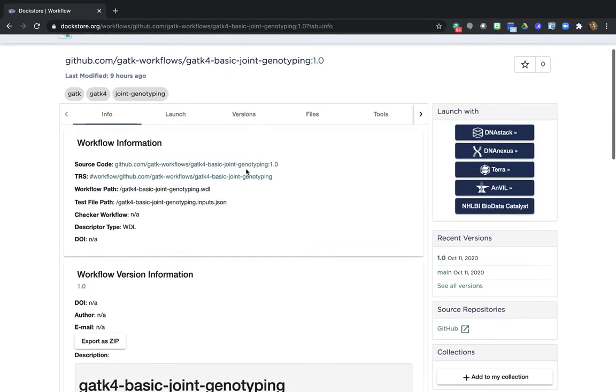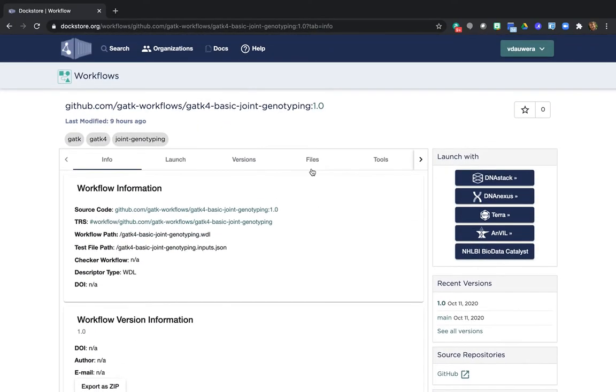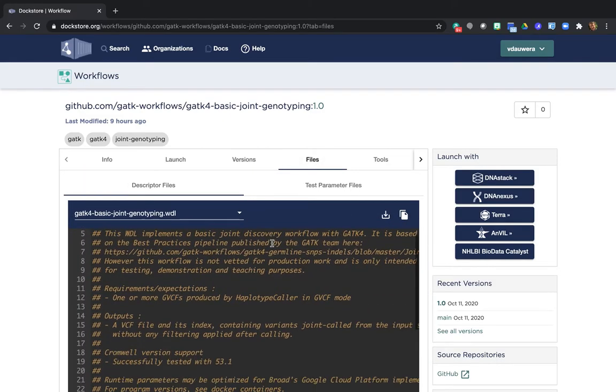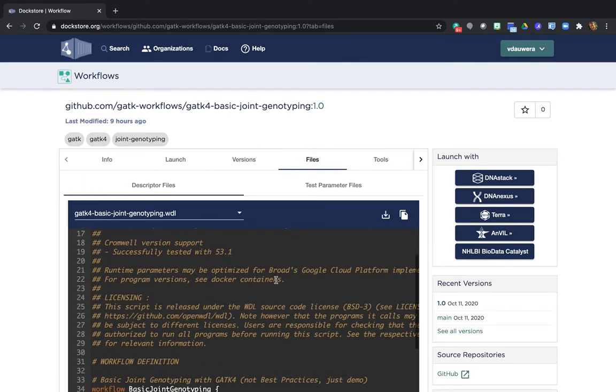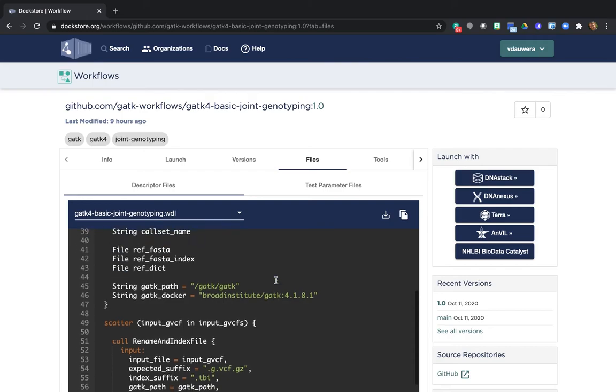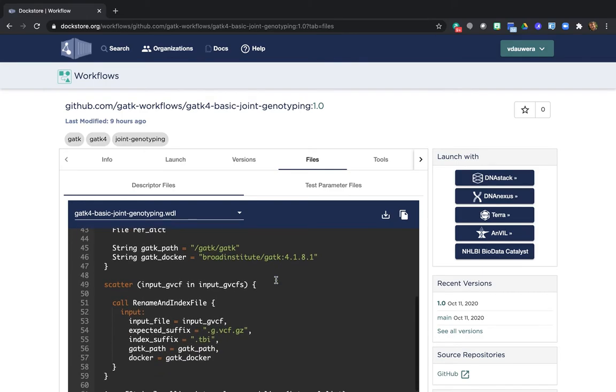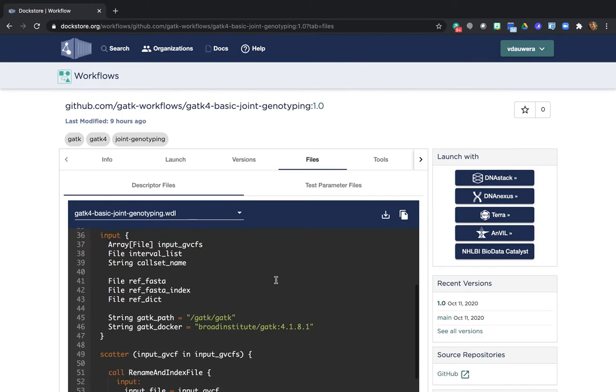You can view the workflow scripts by switching to the files tab up here. So you can inspect the code for the workflow if you're familiar with WIDL, but it's okay if you're not. You don't actually need to interact with this code at all to run it in Terra.